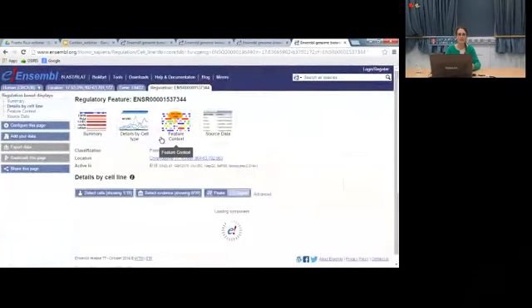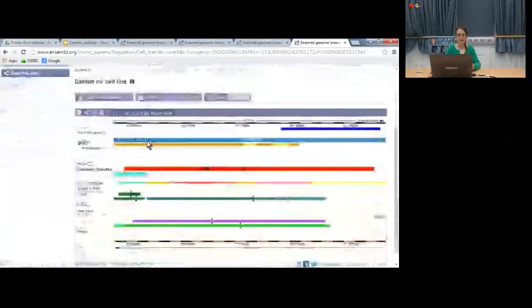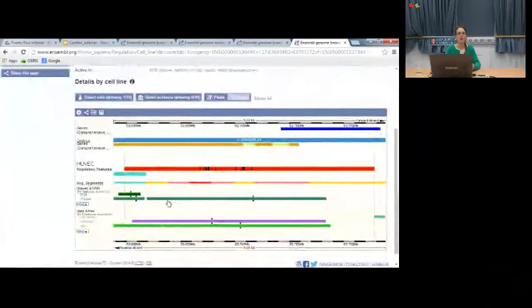I can see that in this particular cell line, you can actually see what were the peaks and the features that were used to construct it. So we can see that overlapping this predicted promoter, we have a region of DNase 1 sensitivity, we have polymerase 2 binding, and we have H3K4 trimethylation. So we can see that there are different features in the different cell lines. I can also choose to show extra cells, and it's only showing me some of the available evidence here. But there are extra things available that I can add if I want to learn more.